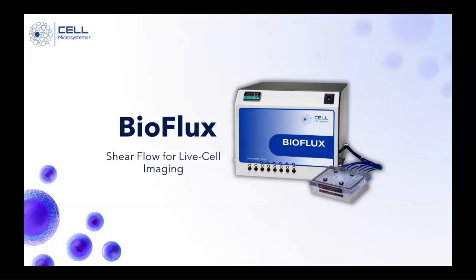Okay. And from the same person, can we use fluorescent surface markers? As long as the microscope that's going to be paired with the system has fluorescent capability, we can use fluorescent markers. And then, is there a limit for the cell types we can use? And then they added 2, 3, 5. I think that's in response to that question.